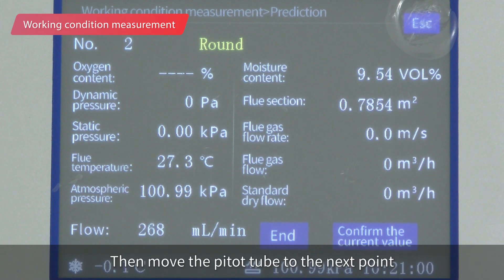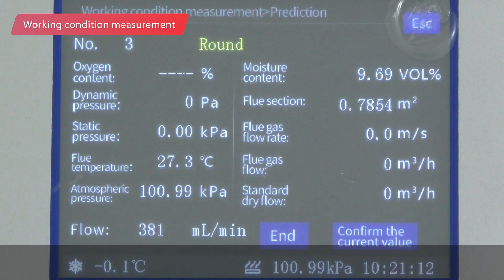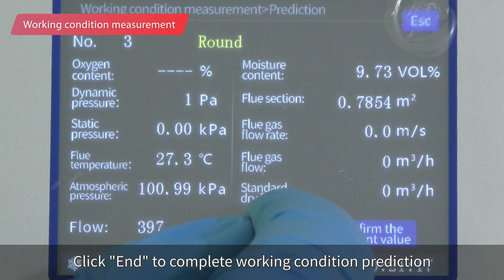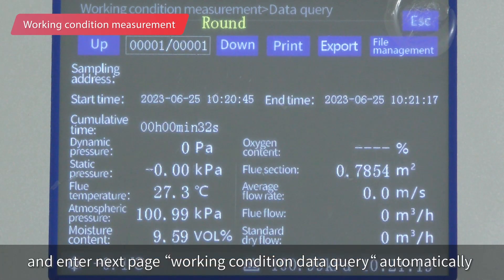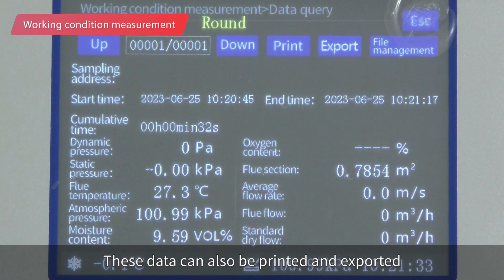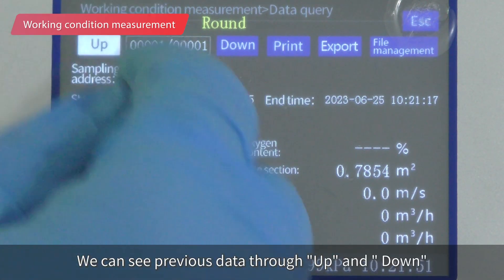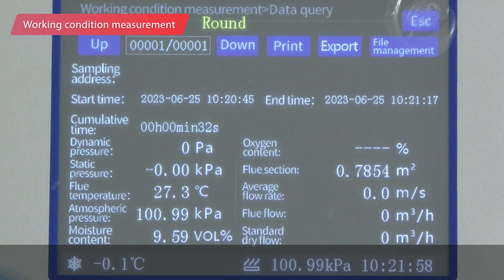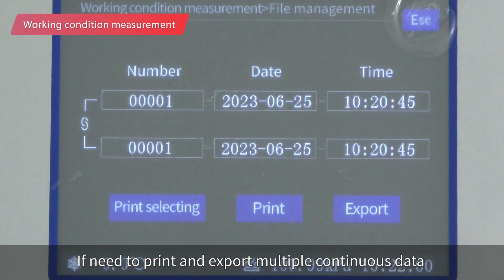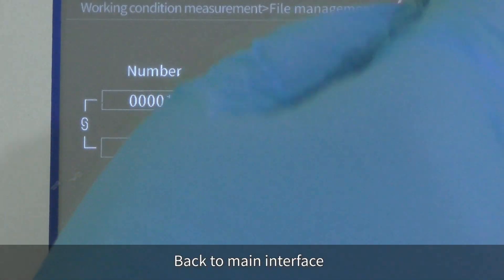Then move the pitot tube to the next point and repeat the previous operation until the last point. Click End to complete working condition prediction and enter the next page. The working condition data query page automatically displays all working condition data, which can be printed and exported. Use the up and down buttons to view previous data. For printing and exporting multiple continuous data, click file management.